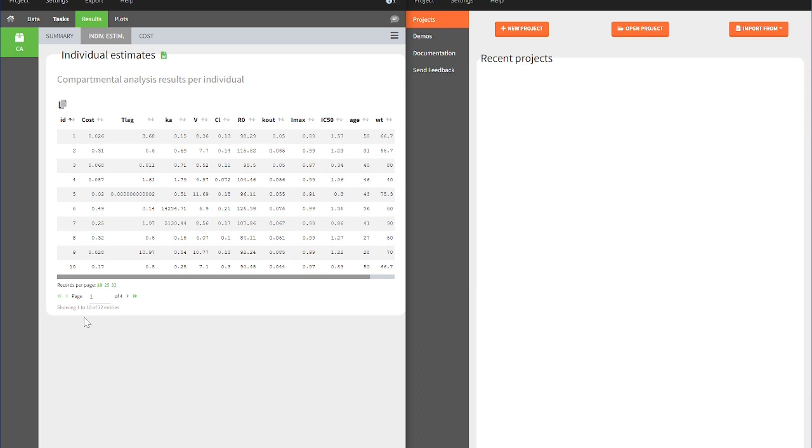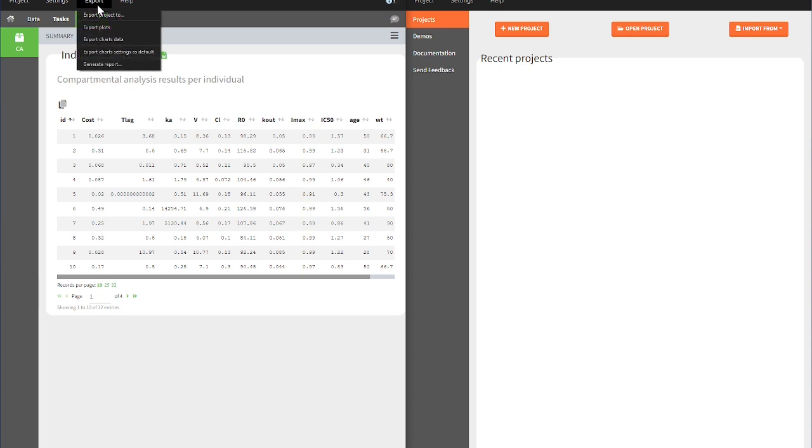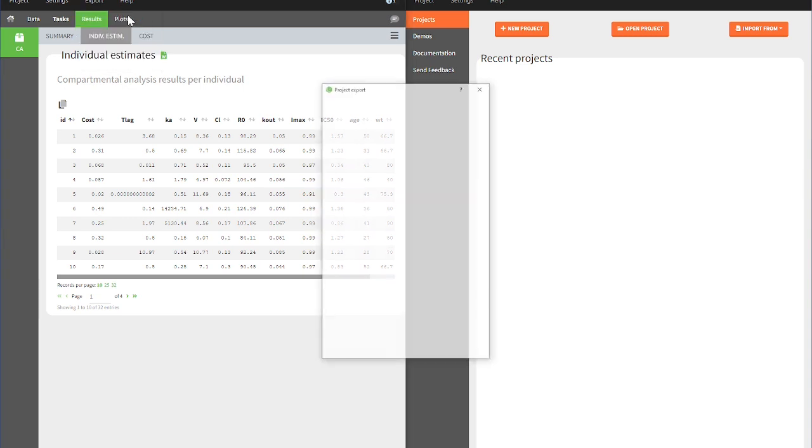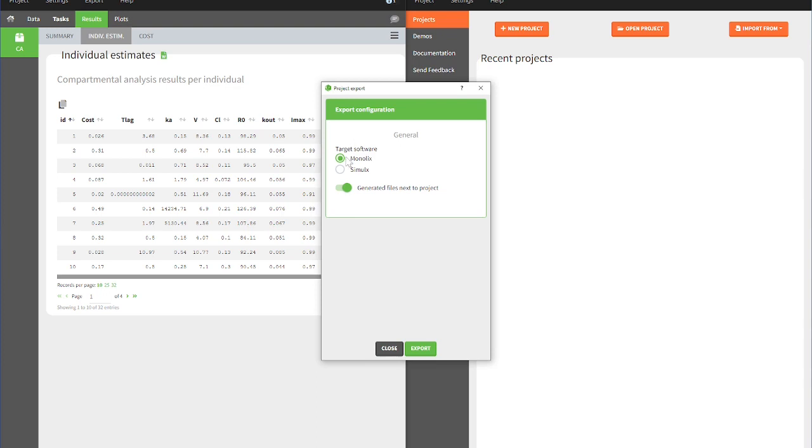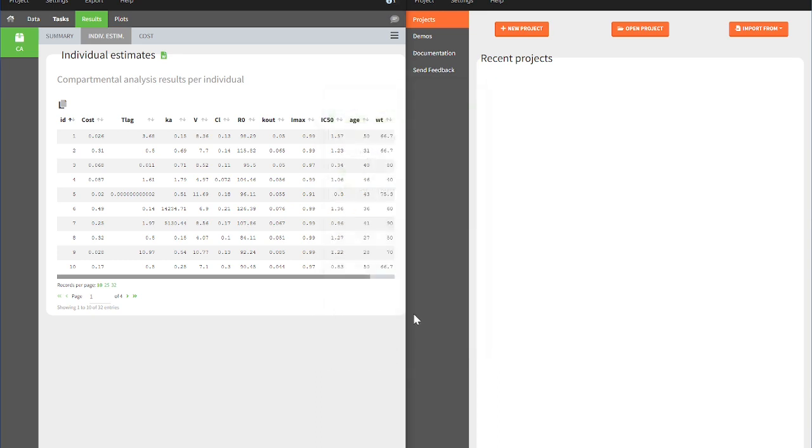We can now easily transfer our CA run from PK-Analyx to Simulx, either directly in PK-Analyx by selecting in the top menu in the export configuration Simulx as a target software, or on the opening page of Simulx by clicking on Import from and selecting PK-Analyx in the drop-down menu.